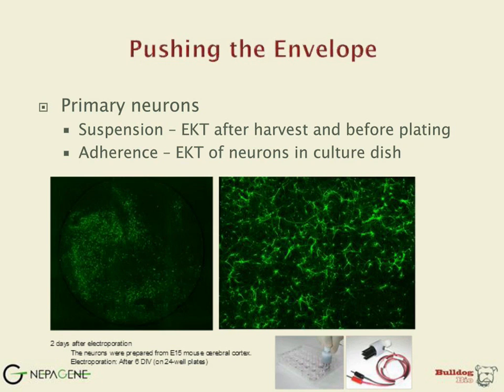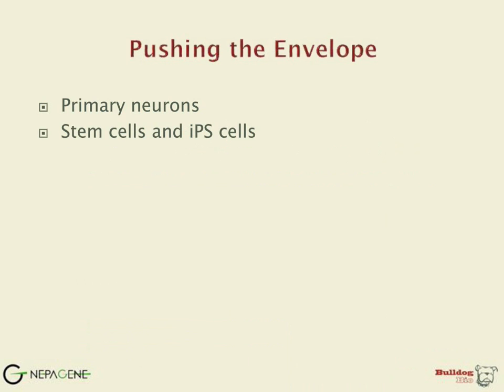Electrokinetic transfer has been successfully applied to stem cells, induced pluripotent stem cells, T cells, and dendritic cells using the NEPA 21. These cells can be very challenging as they tend to be quite finicky. We find the results vary quite a bit depending upon cell type and lab. In general, we consider it a success when both the transfection efficiency and cell viability are above 35%.